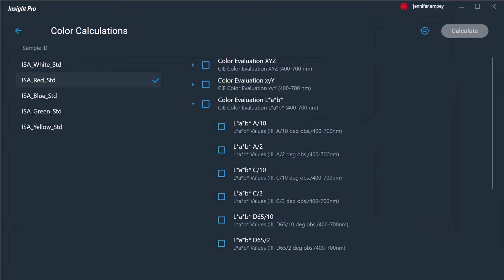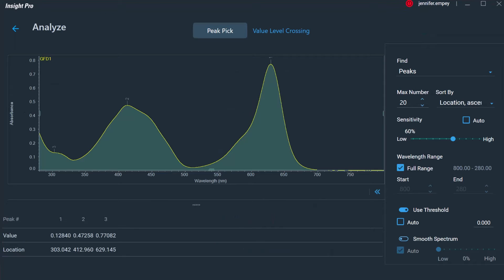The color calculation functionality within the Math drop-down menu features a variety of color calculations, including the ability to determine CIE LAB and tri-stimulus values, eliminating the need to use a secondary color analysis software or perform manual calculations.